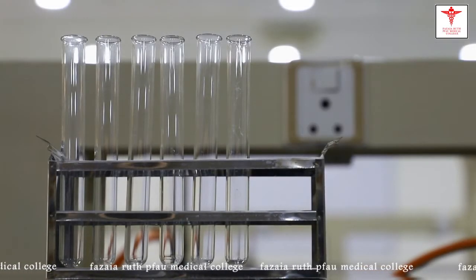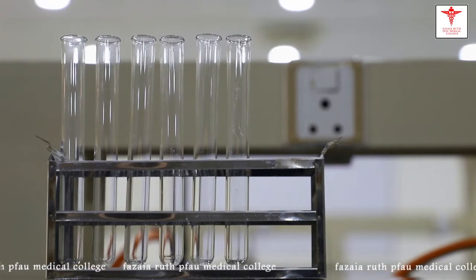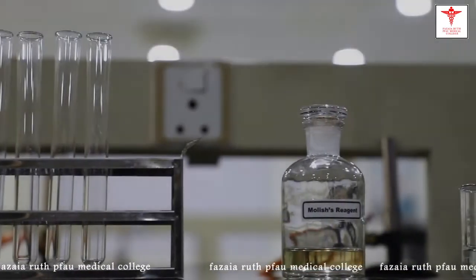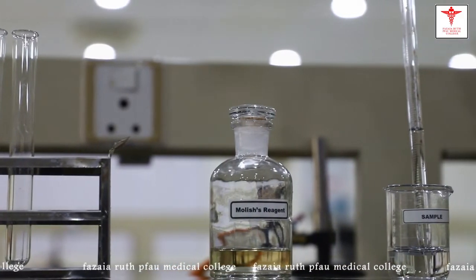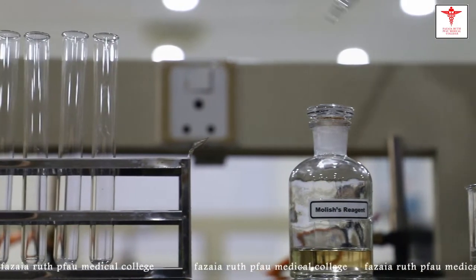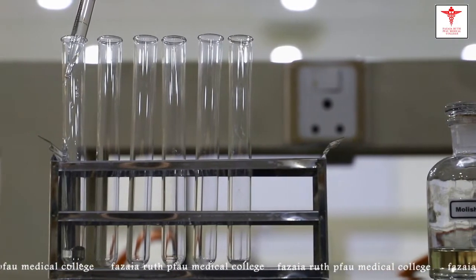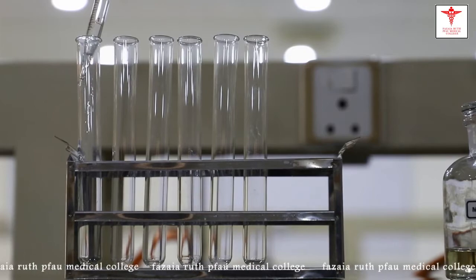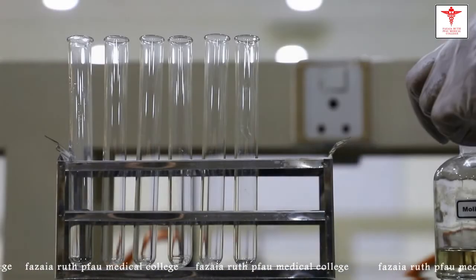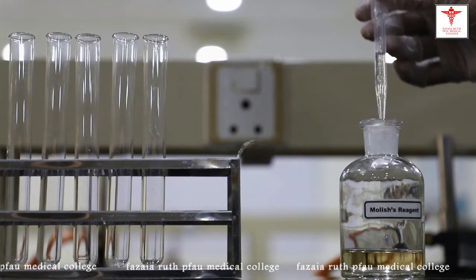So students, we are here at the lab, and now we'll perform all the tests pertaining to detection of carbohydrate. So we'll begin with the Molisch's test. For this we'll take 5 ml of original solution. Original solution is the solution or the sample which contains the unknown carbohydrate which we have to detect. After this we'll add 6 drops of 1% alcoholic alpha naphthol.